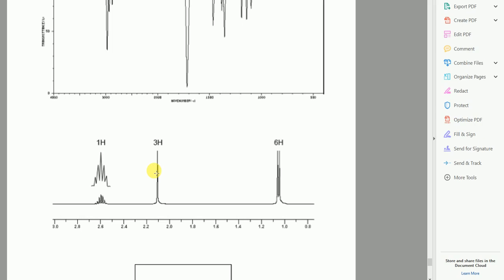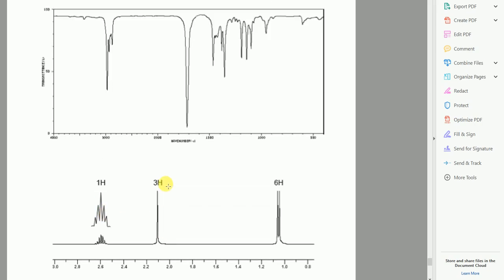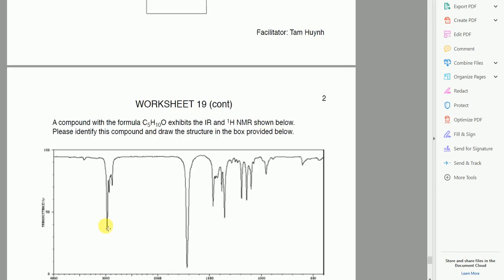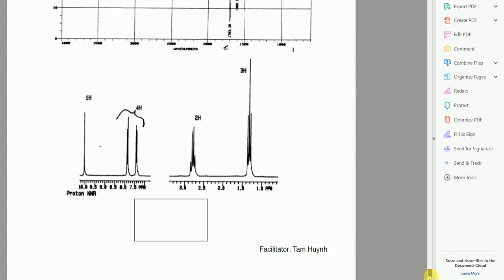And then you might ask, well, how do I know it's not 1 hydrogen on one side and 1 hydrogen on the other side? Well, the way that we know this is because of the way Proton NMR works. When you have combined environments, and this won't happen for this really too much. It will happen. You have complicated things like what we're having over here. But usually it's what's next to it. Let me see a better way to introduce this. It might be better if I look at, where is it?